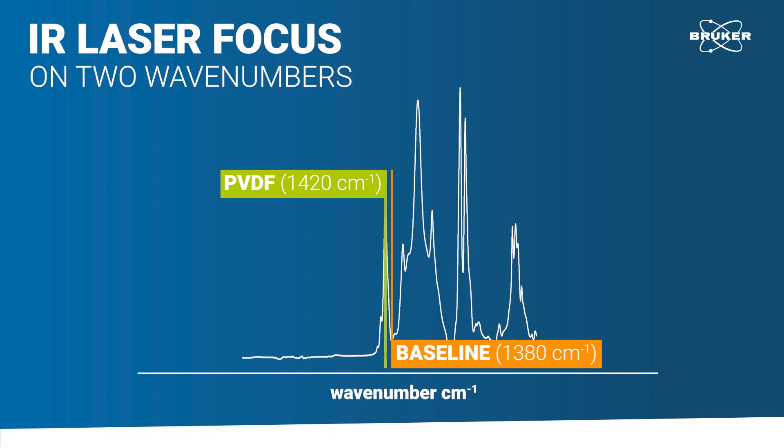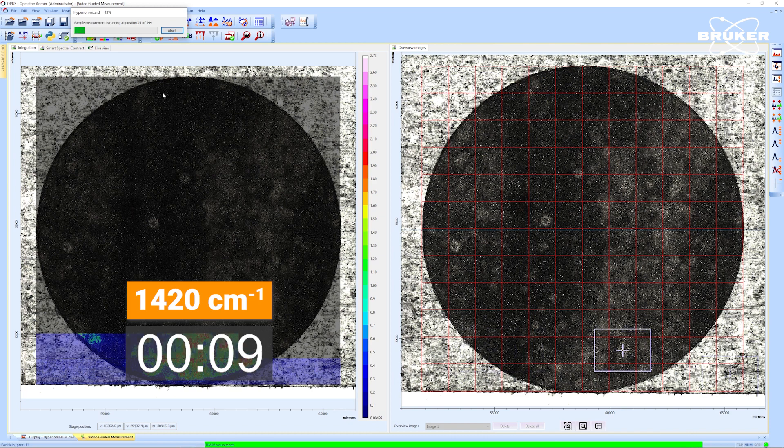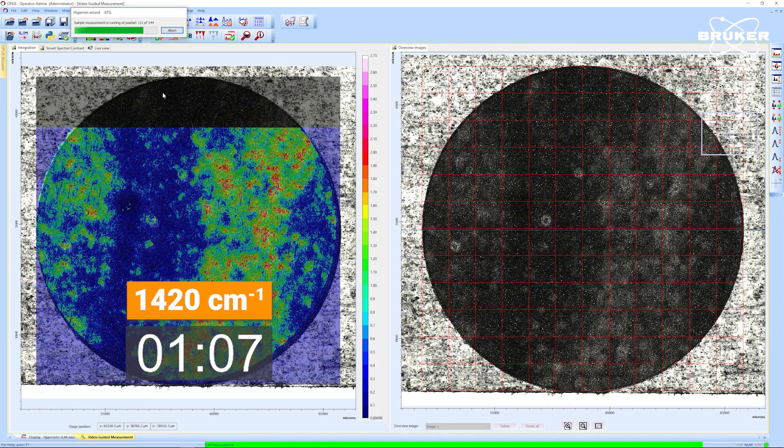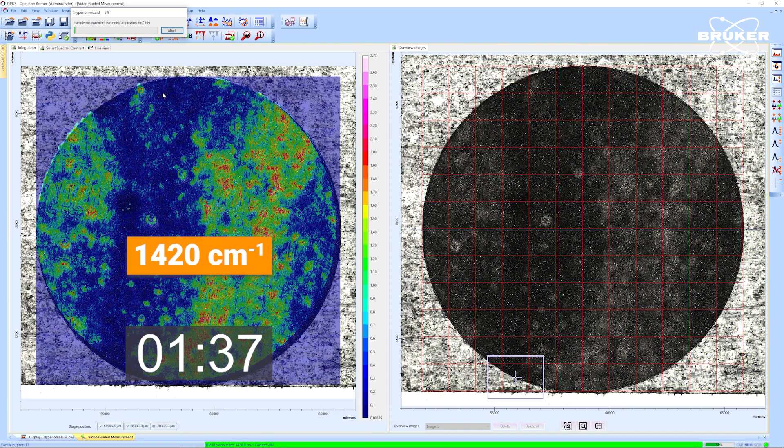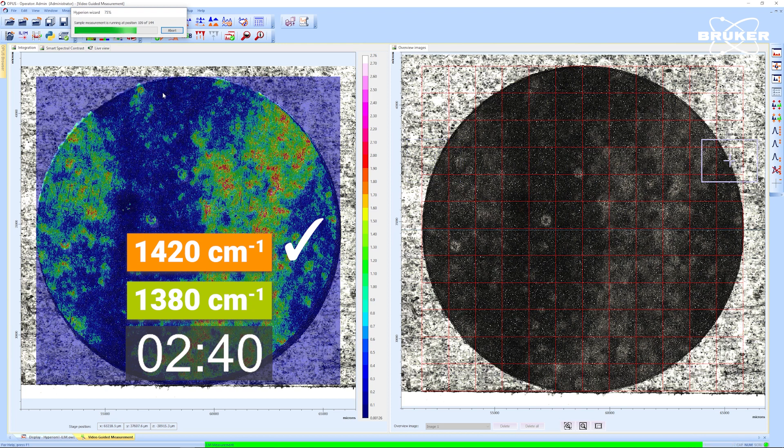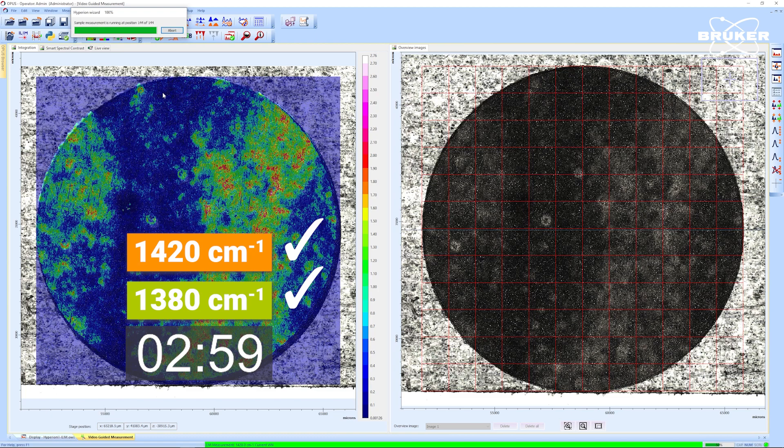The measurement is carried out in reflectance mode and is entirely non-contact. The efficiency of IR laser imaging becomes clear as we watch the laser scan rapidly across the anode surface. In just under three minutes, the measurement is finished.